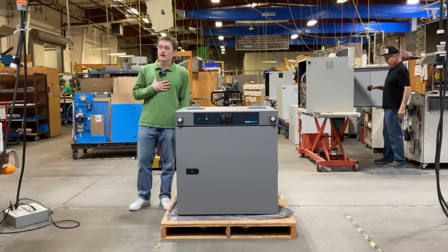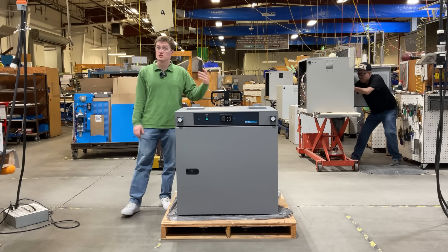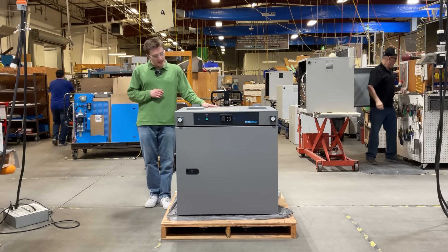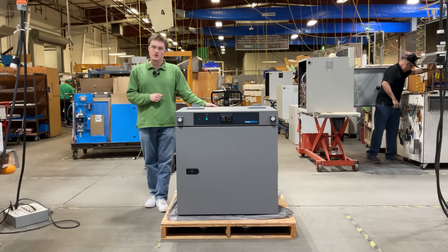Hello again, my name is Kord Sengstake. I'm a design engineer here at Sheldon Manufacturing and today I'm going to be introducing the SMO5HP-2 High Performance Forced Air Oven, designed to deliver uniform heating, unmatched efficiency, and long-term durability.